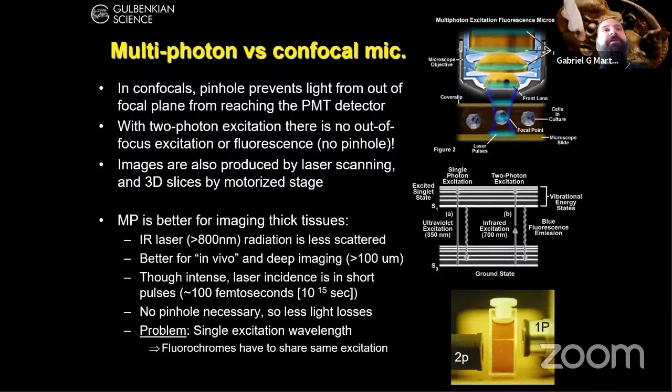So the blue light is about 480 nanometers. Ultraviolet is around 350 or 400 nanometers. If you double this, you end up in the near infrared regime, about 700, 800, 900, and even 1,000 nanometers of light. Beyond 700 nanometers, the human eye can no longer see this light. So to us humans, this light is invisible. But if we could see it and put this infrared light on our hand, we could see that a lot more of it is coming out of our hand, even more than with the regular red light that you would see if you had a white bulb on your hand.